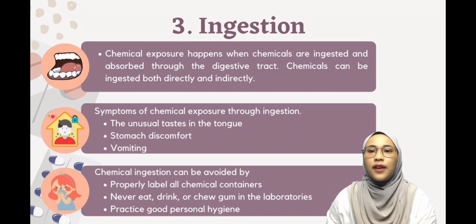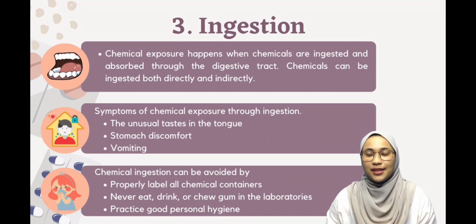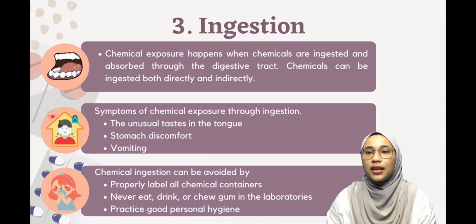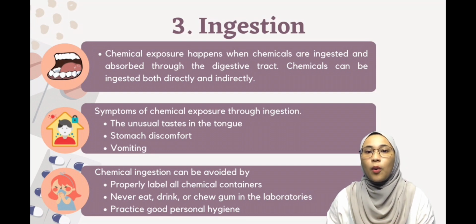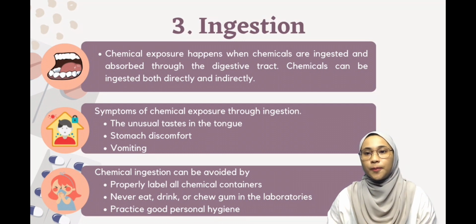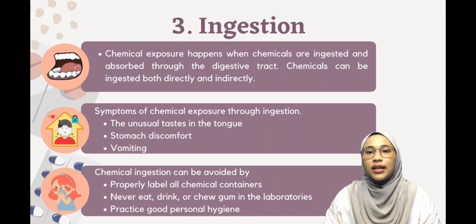Then, we should never eat, drink, or chew gum in the laboratories. Finally, we must maintain proper personal hygiene. For example, after working with chemicals, we must completely wash our hands even if gloves are worn. It is to decrease the possibility of cross-contamination.